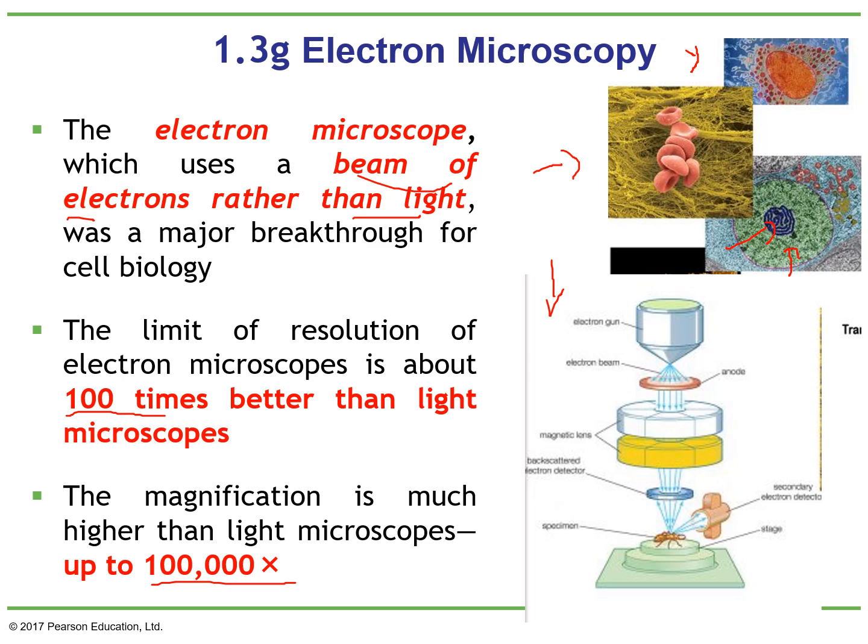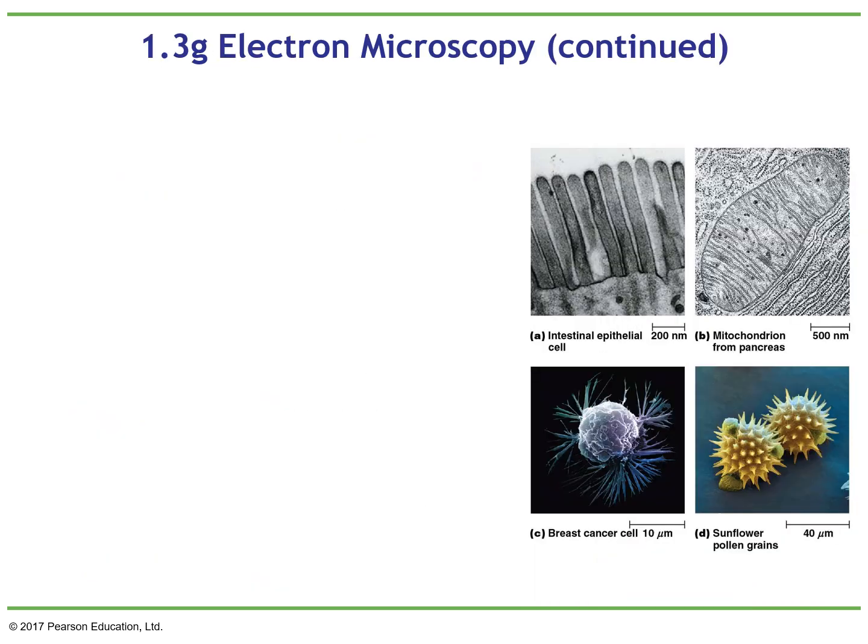One way they got these pictures was using this type of microscopy, and later they used computer simulations and animations to show us how we think that they work. And this would have been impossible with only confocal microscopes or that type of microscopy.